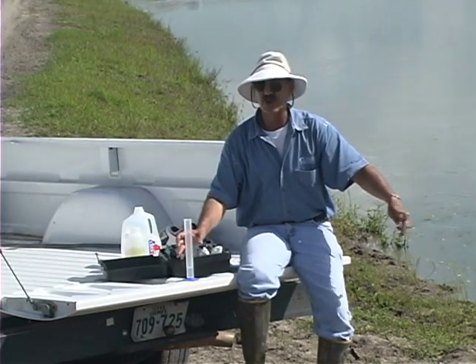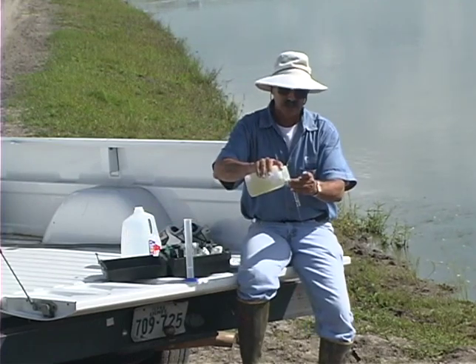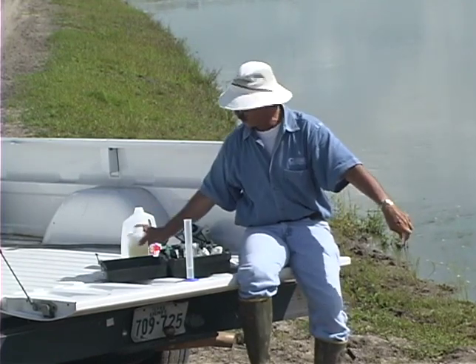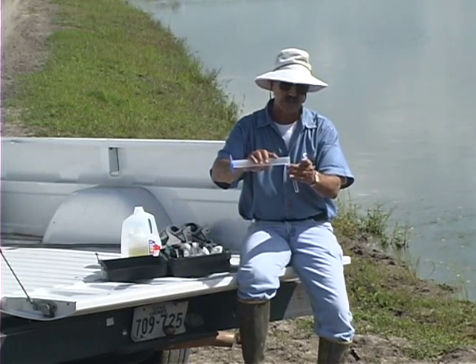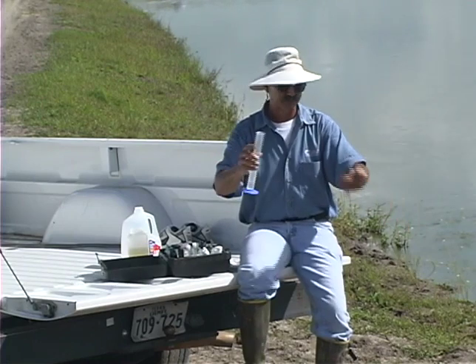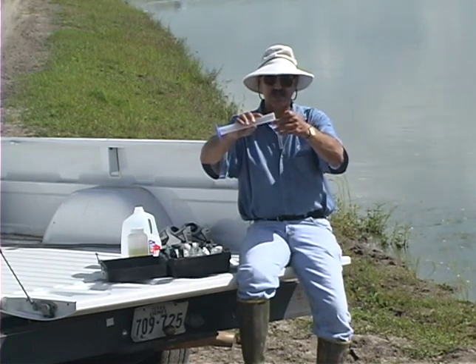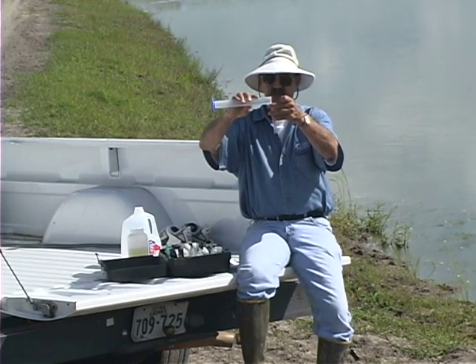As I mentioned before, it's very important that we rinse the testing equipment in the water that's actually going to be tested, so that any water that remains is the water we want in there. So again, we'll start with our 5 mLs of sample water. This is now our diluted sample water.